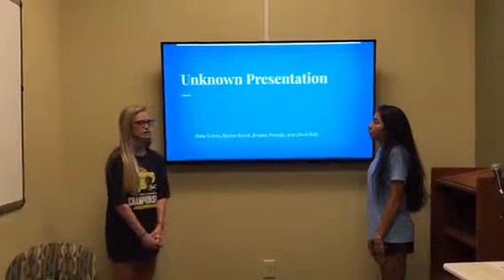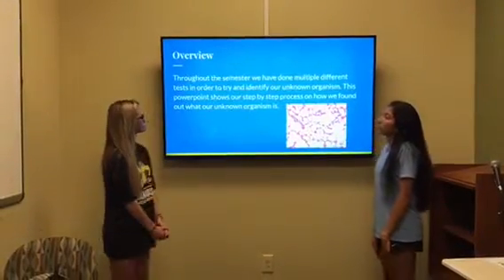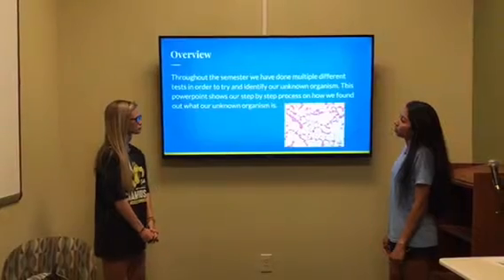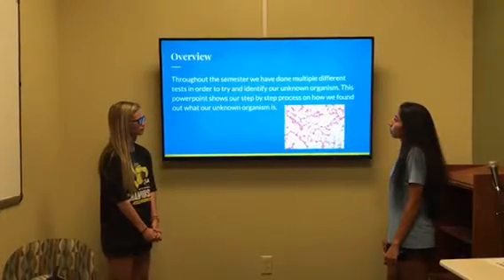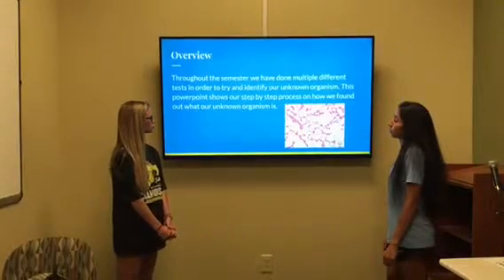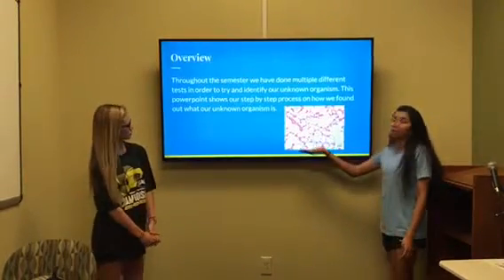This is our unknown presentation. Throughout the semester, we have done multiple different tests in order to try and identify our unknown organism. This PowerPoint shows our step-by-step process on how we found out what our unknown organism is. And this is a picture.